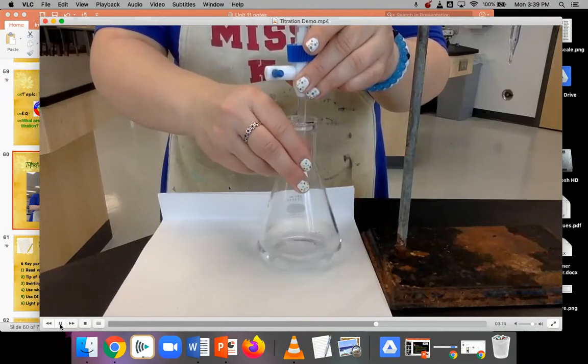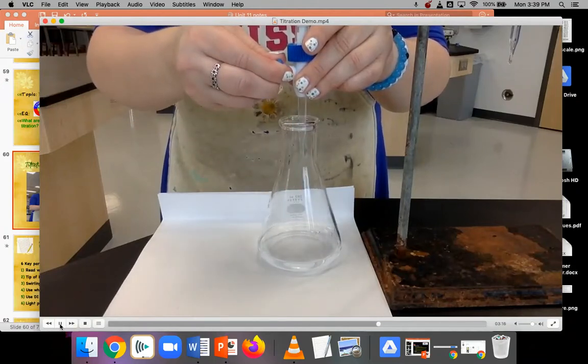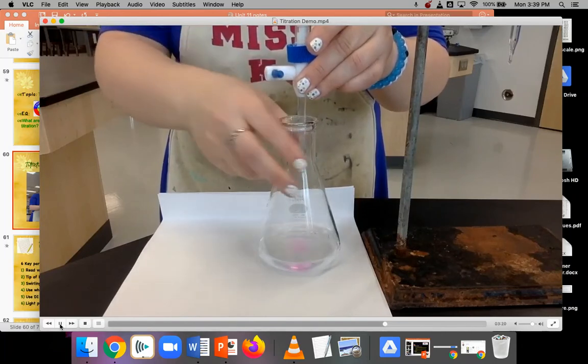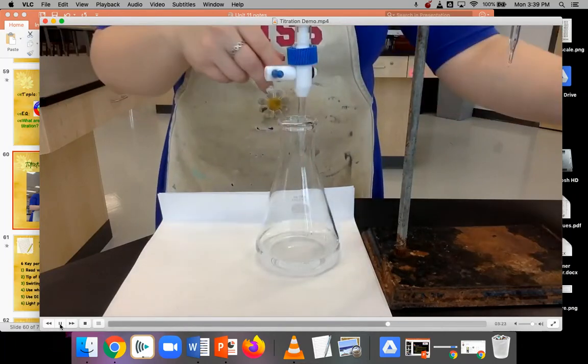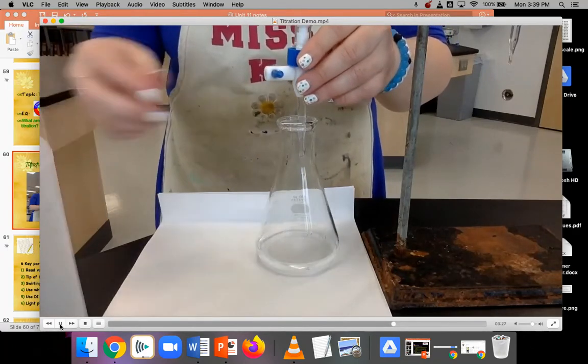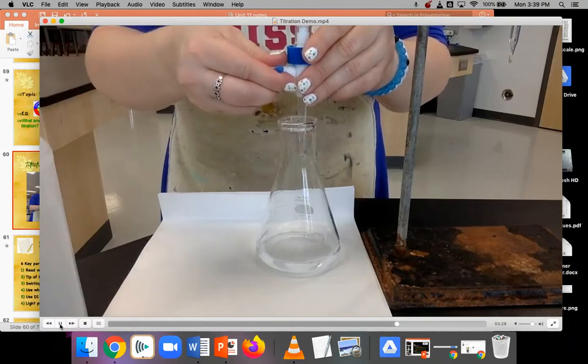Ooh, so see how that stayed for quite a while? That means I'm close. So look at how slowly I'm opening the stopper. I'm holding the stopper because bases get slippery so that it doesn't fall out and I get base everywhere. I'm rinsing the tip, all those little base droplets, getting it into my sample, swirl that up.